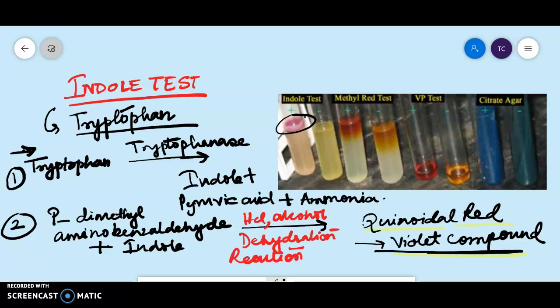So when people ask what is your observation, you say: development of a cherry red color at the interface of the reagent and the broth within a second after adding the Kovac's reagent indicates the presence of Indol. Now I will move on to the procedure.